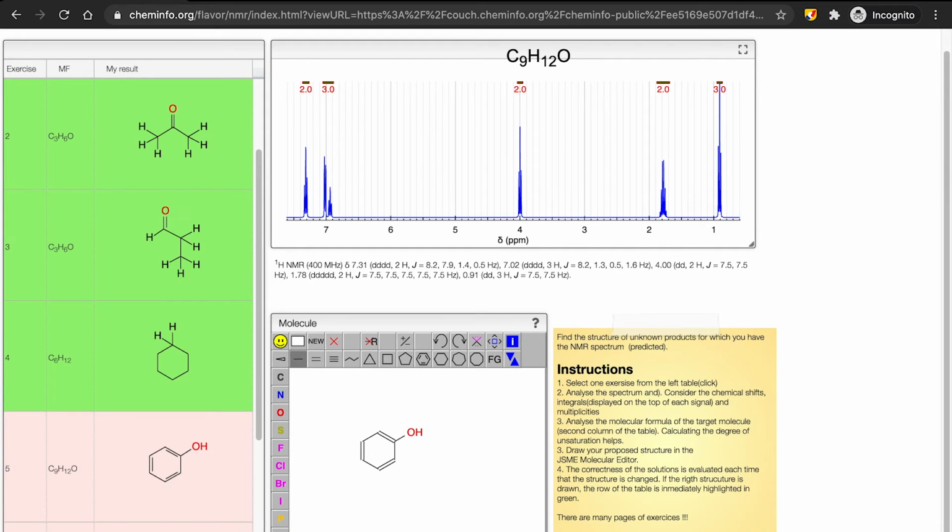So if we go here, connect to alcohol, and conveniently we can just fill in the other carbons. So we have 6 carbons here. We have to use 3 more. So if we just add 1, 2, 3, we end up getting the right answer. Okay, so sometimes when you approach an NMR problem, you kind of generate a structure and then check to make sure that it's consistent with the spectra you're given. So in this case, let's draw in the hydrogen and examine why this is the correct structure.